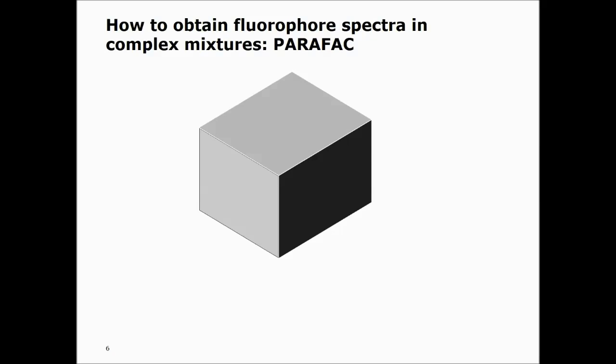After successfully measuring and correcting our data, the question now is, if we have complex mixtures that we measured, how do we obtain fluorophore spectra in this complex mess that we're working with? And this is where PARAFAC, or parallel factor analysis, comes into play.